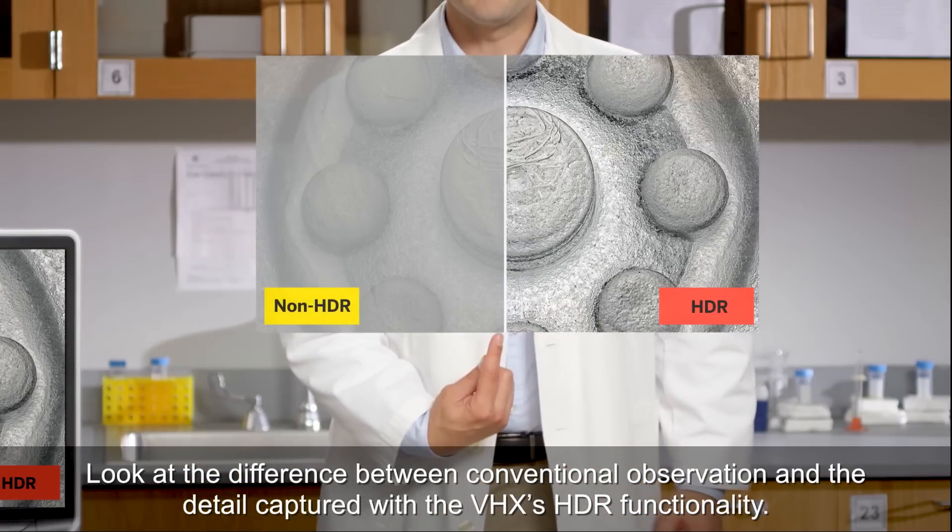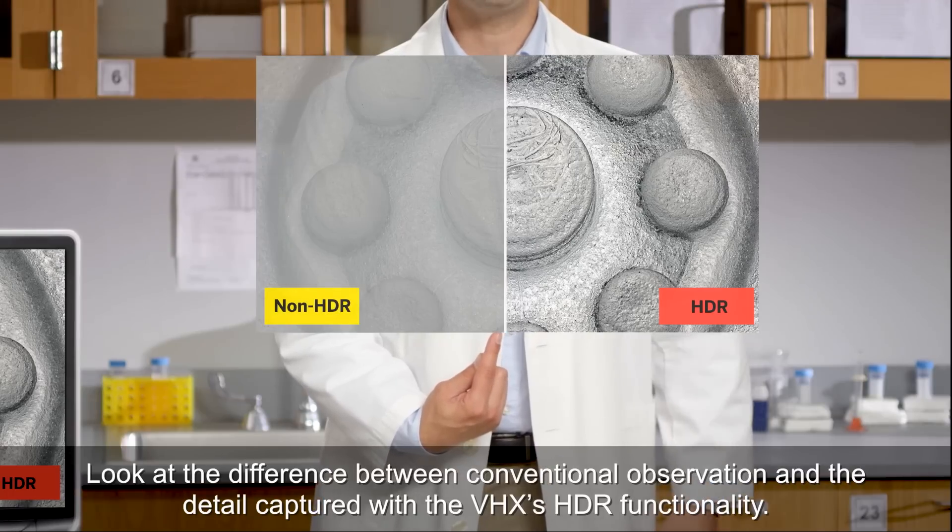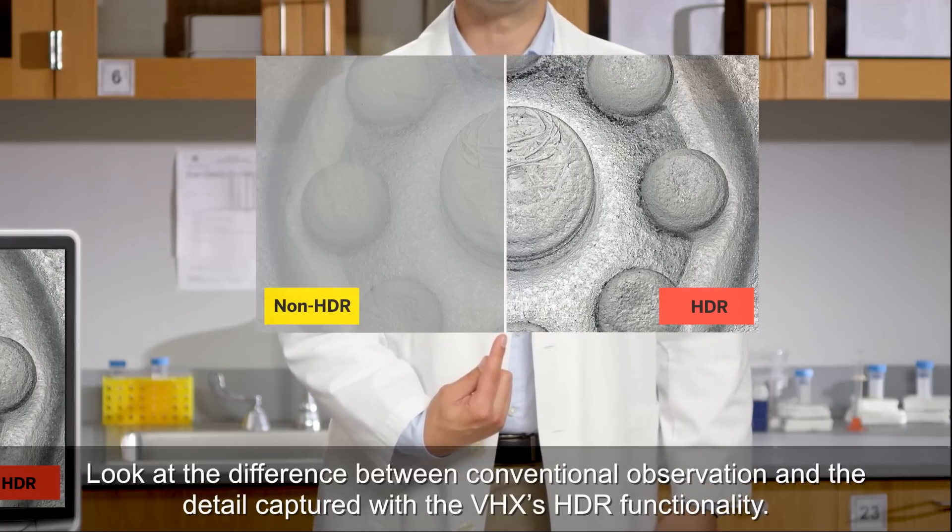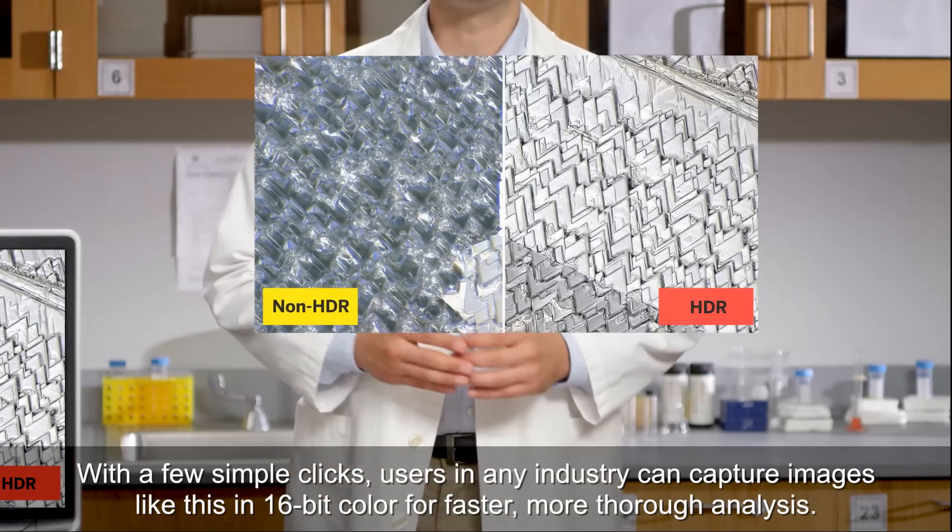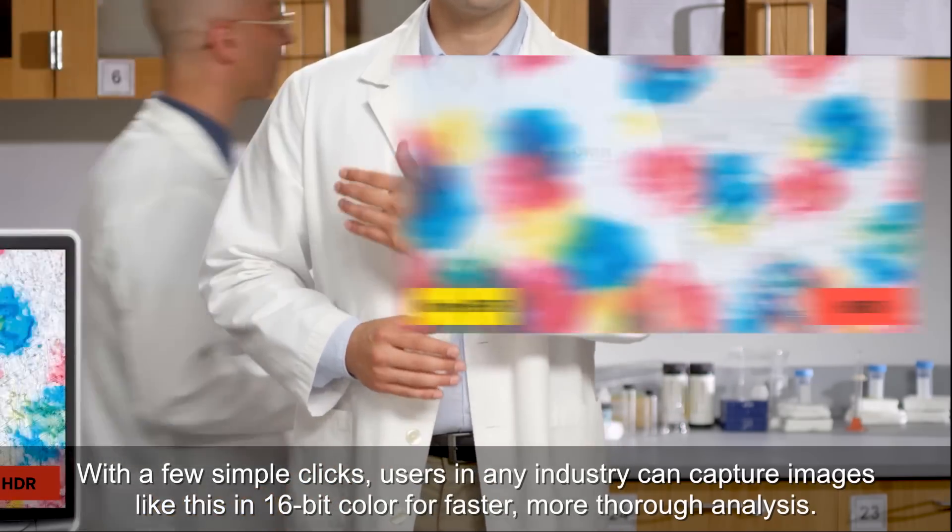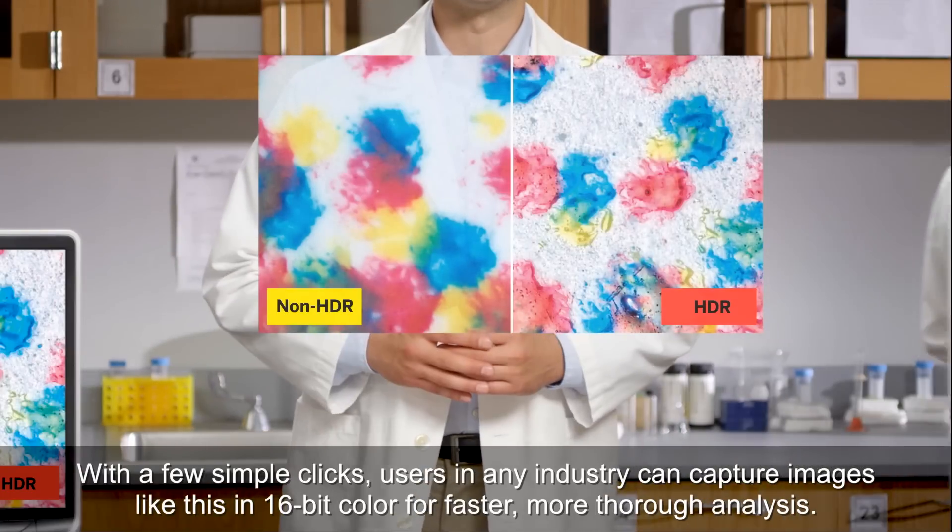Look at the difference between conventional observation and the detail captured with the VHX's HDR functionality. With a few simple clicks, users in any industry can capture images like this in 16-bit color for faster, more thorough analysis.